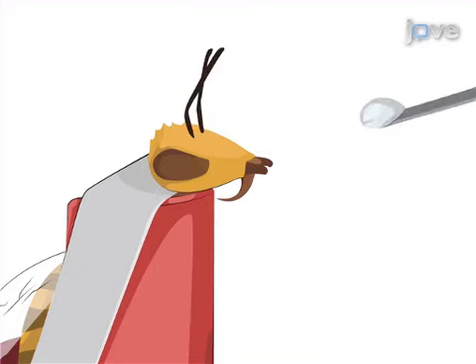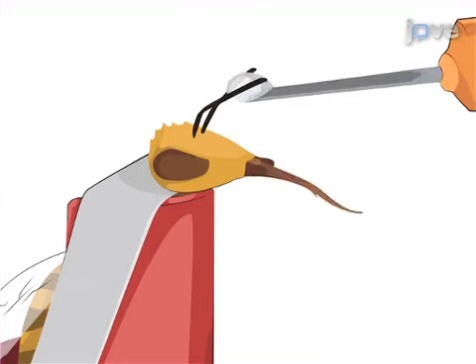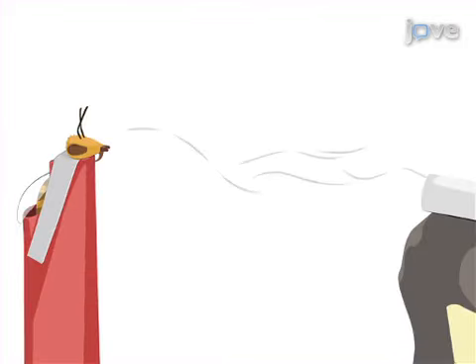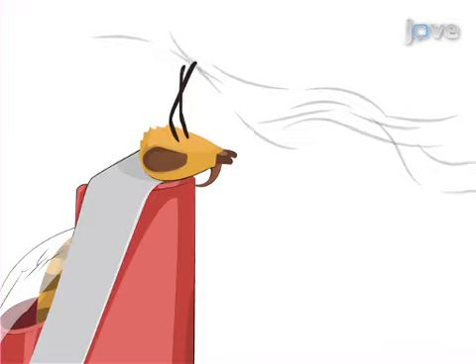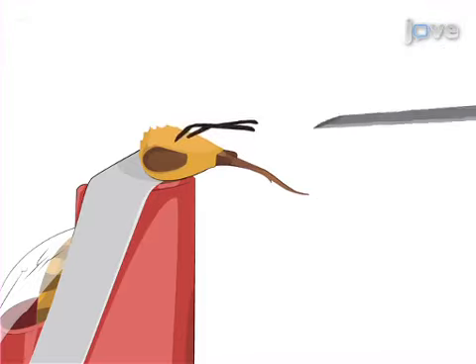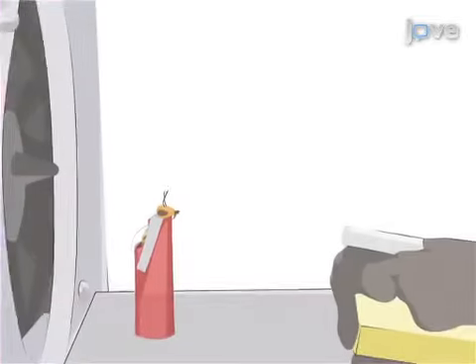Next, bees are selected for conditioning that show sufficient motivation when their antennas are touched with sucrose. During conditioning, odor presentation is paired with the sucrose reward to elicit the conditioned response.